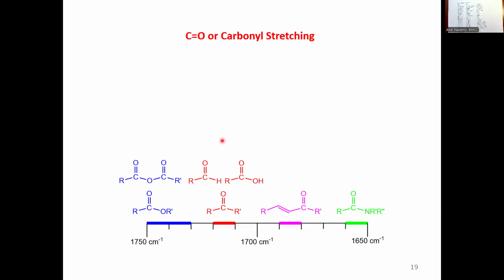The same values, but as a reference, amides. Some people call it amides, some people call it amides. I call it amide. Feel free to use any pronunciation you want. Conjugated ketones, this one is the more conventional. A classical C=O should be either an aldehyde or a ketone, or here a carboxylic acid, the carboxyl group. And all the way on the left, 1750 is for anhydrides.